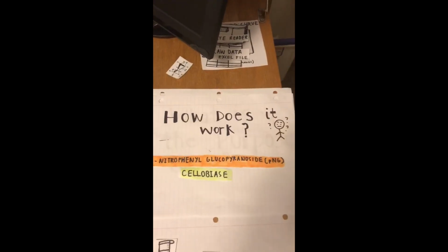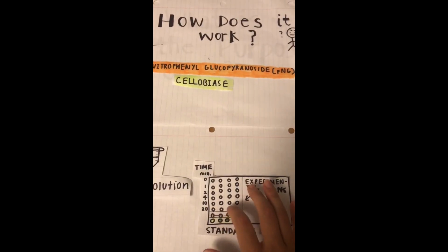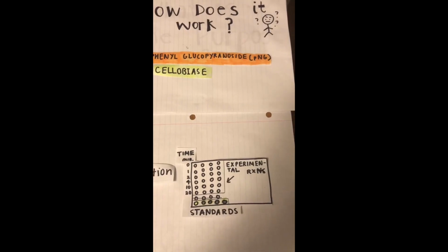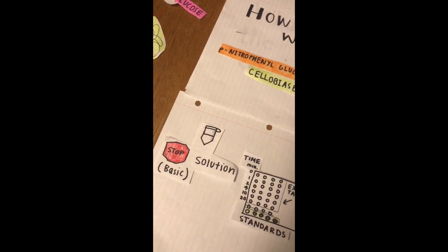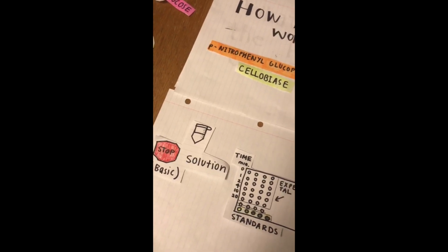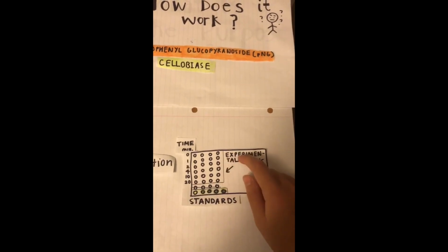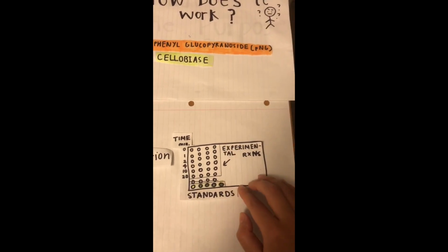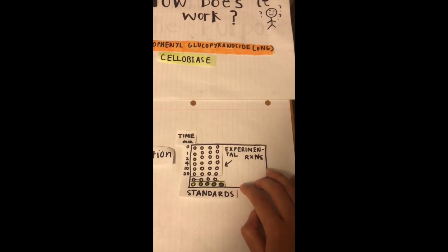These mixtures will then be added to a 96-well plate in different wells at different time points. These wells will also contain a basic solution, also called a stop solution. This solution not only stops the reaction from proceeding, but it also turns any product present yellow. These experimental reactions can then be compared to standards, which contain known concentrations of product in stop solution.